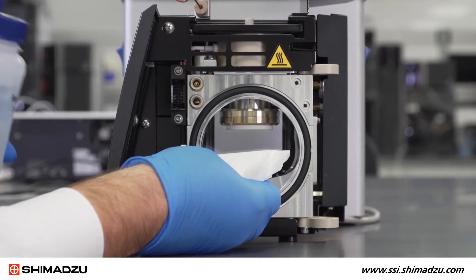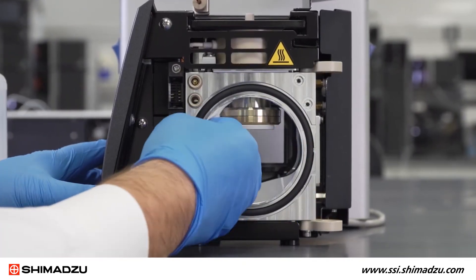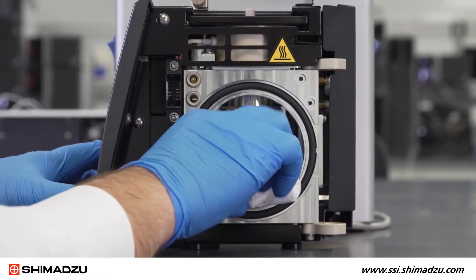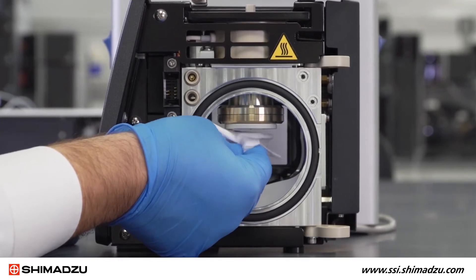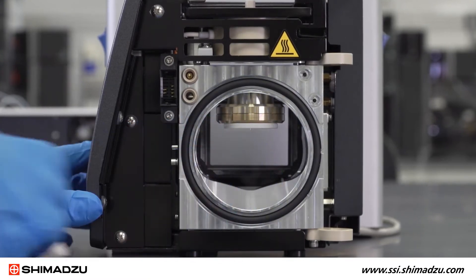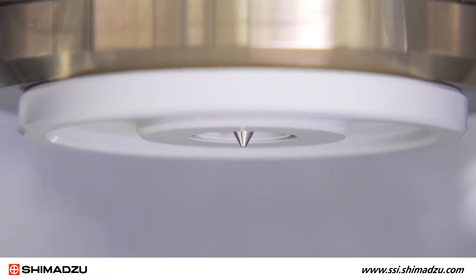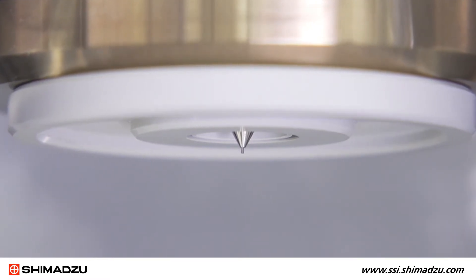Use a lab wipe and an appropriate solvent to remove buildup from the metal surfaces of the source. Water is recommended for salts and methanol for organics. Clean the inside walls of the ion source as well as the tip. After cleaning is complete, adjust the ESI spray needle protrusion to about 1 mm and reinstall the corona needle if present.